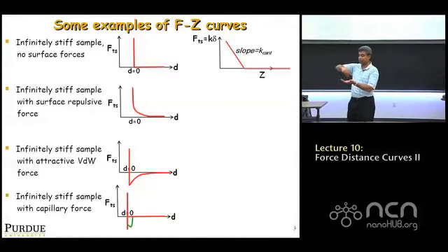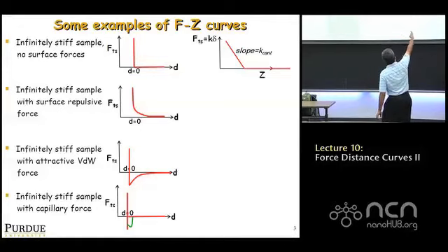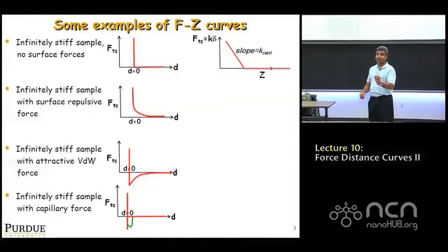So in other words, when you touch the sample and move down, the amount you move down is exactly the amount by which the tip goes up relative to the base. So in the linear part of the slope, the amount of cantilever deflection equals the z motion, right? That's the key thing.